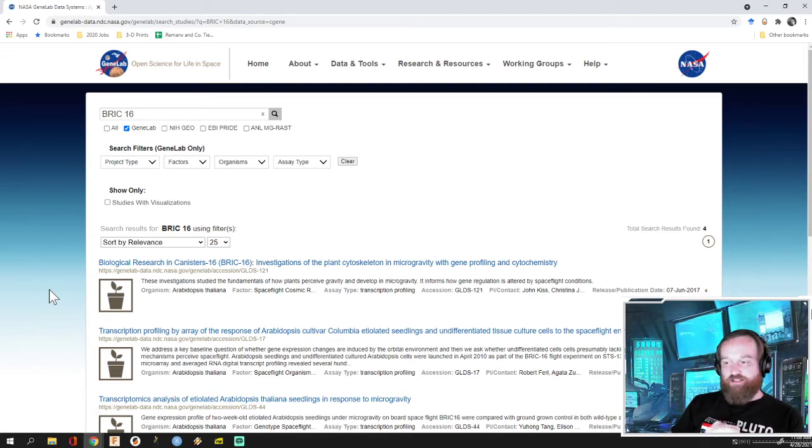It's nice because there's no need for the astronauts to actually do some of the experiments. Crew time's a big limited resource for spaceflight experiments. And then at the end of the experiment, you can freeze them and put them at -80 degrees to preserve all the RNA that is present in the sample, our measure of gene expression.